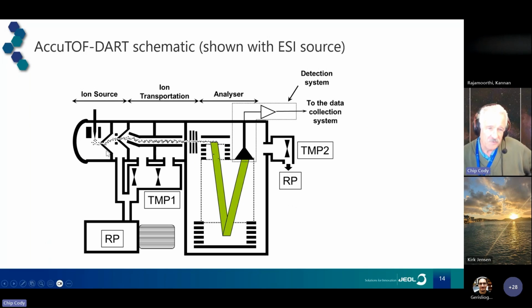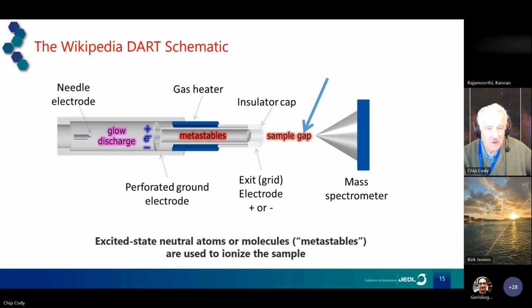The atmospheric pressure interface is here with two off-axis skimmers, a bent RF ion guide, and a reflectron. The atmospheric pressure interface is great because I can put anything in front of it, no matter how dirty, and we never really contaminate the back end of the mass spectrometer.